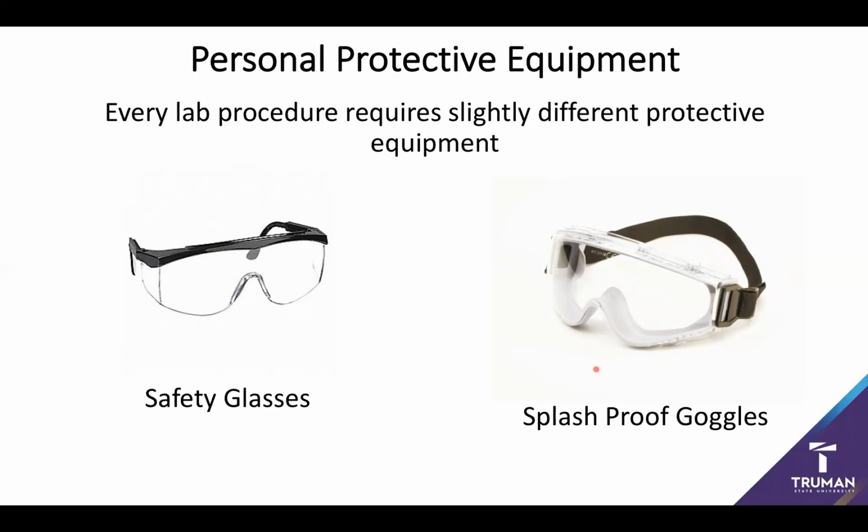They're there for a reason, and if you have to choose between one form of eye protection, always choose the splash-proof goggles, because this is essentially what you're going to need at some point in your chemical career. So if you have to choose one, choose the one that's more likely to do you good under a wider range of circumstances.